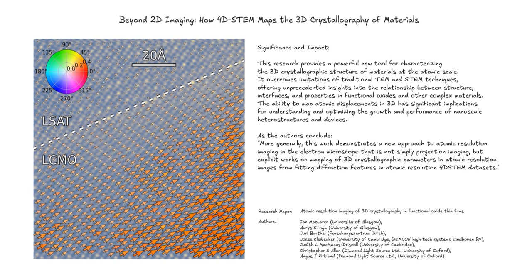And fine-tune those properties. It's fascinating how seemingly subtle changes at the atomic level can have such profound effects on a material's behavior. The researchers were able to observe and quantify these effects using 4D-STEM. This technique truly opens a new window into the world of materials science.